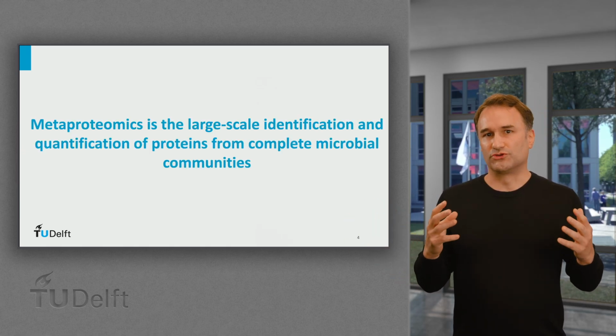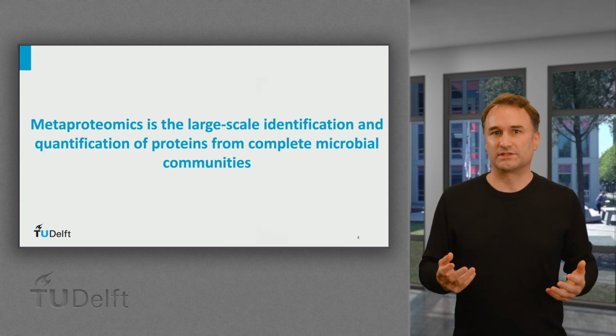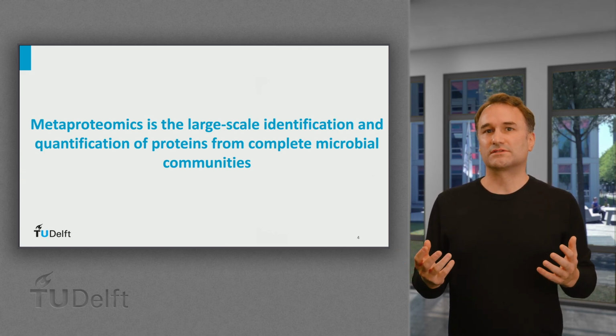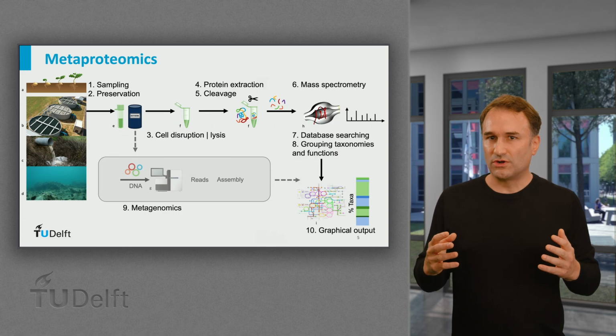In short, metaproteomics is the large-scale identification and quantification of proteins from whole microbial communities. This provides information about the microbial biomass, expressed enzymes, and active metabolic pathways under specific conditions. So how does this work?